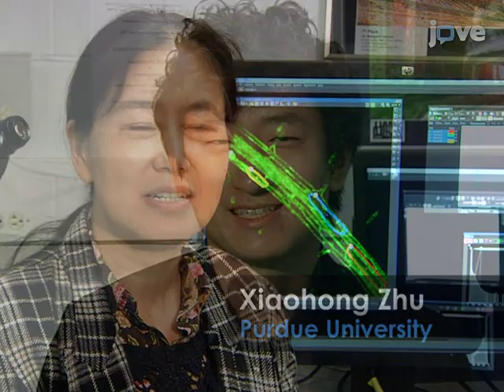This method provides insight into calcium signaling during the stress response in Arabidopsis, but it can also be used in other contexts, such as during development or defense in other plant models. Demonstrating this method will be Shen-Yi, a student from our lab.